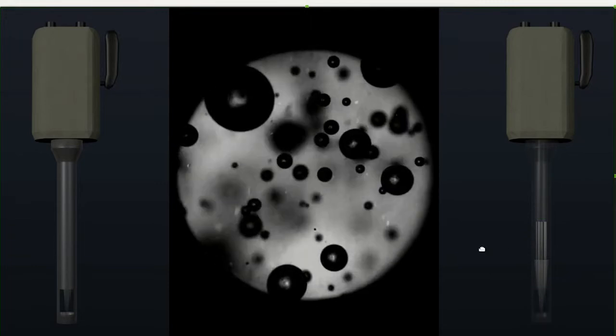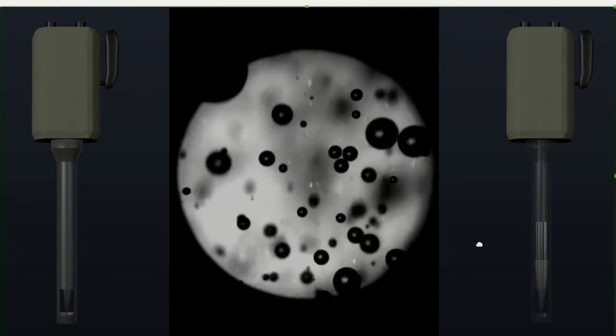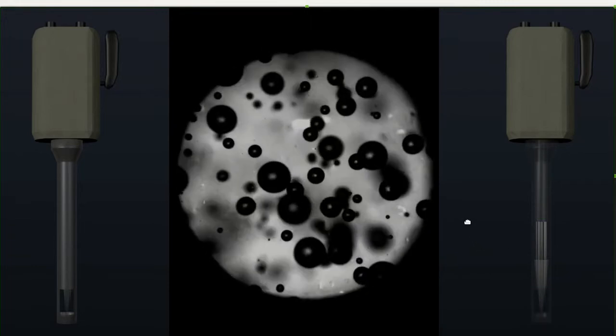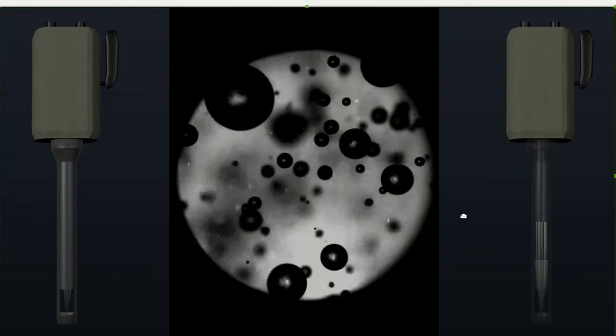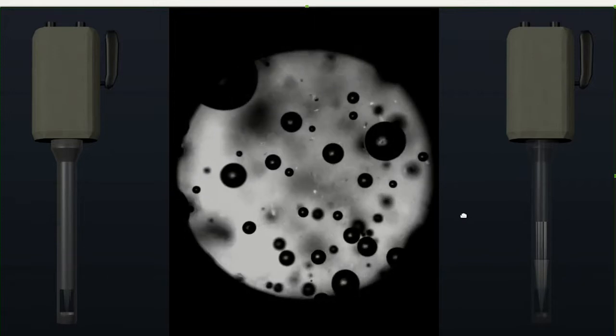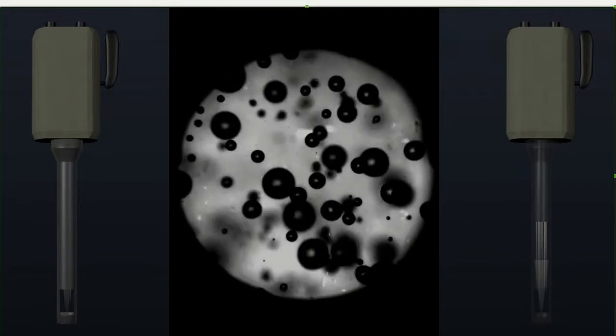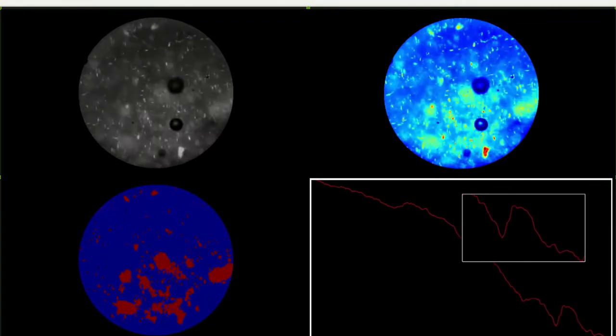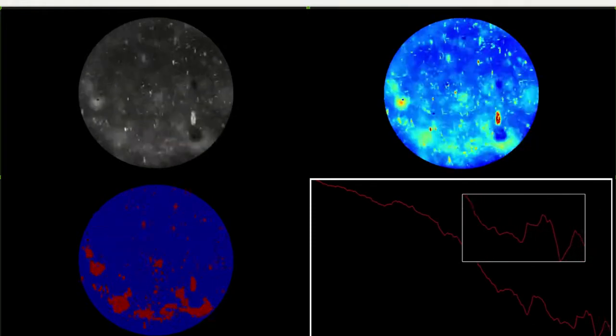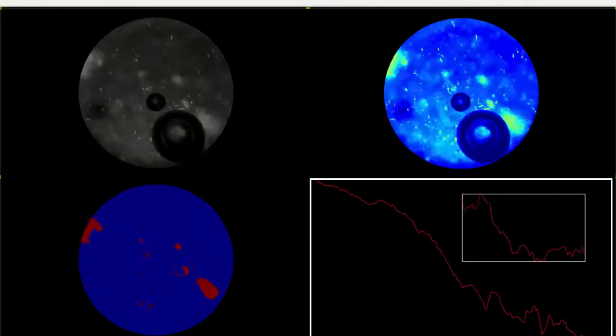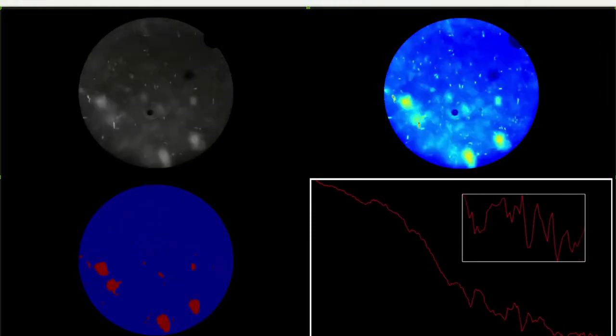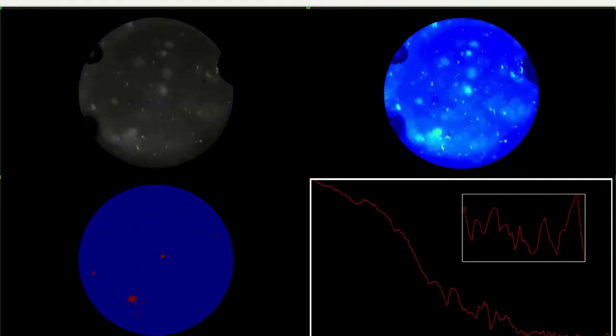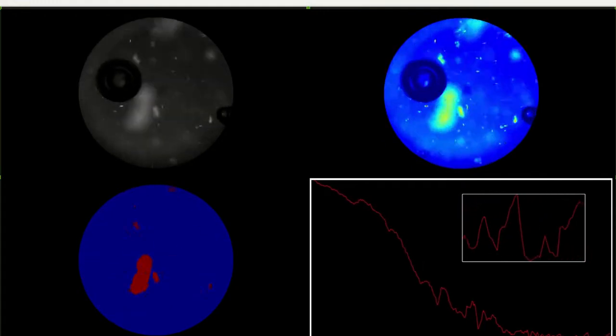The image in the middle shows a video analysis of tofacitinib ointment using the Oculus. The following shows how the images produced by the Oculus can be analyzed by a computer to produce output similar to that of an FBRM or UV.